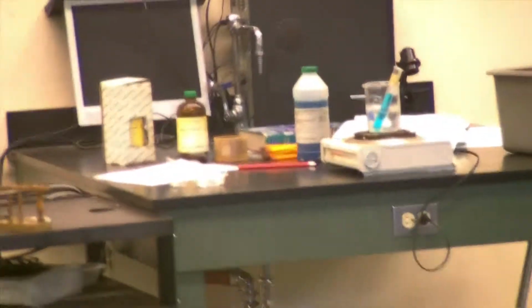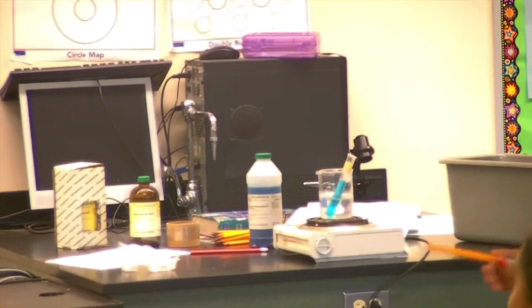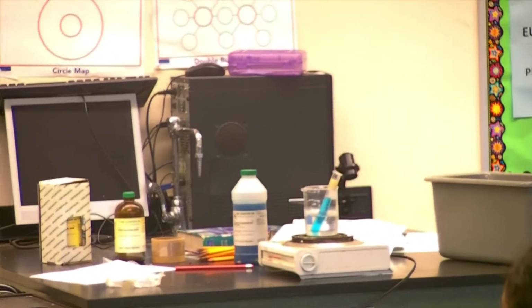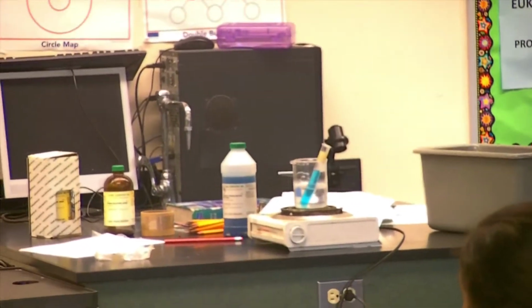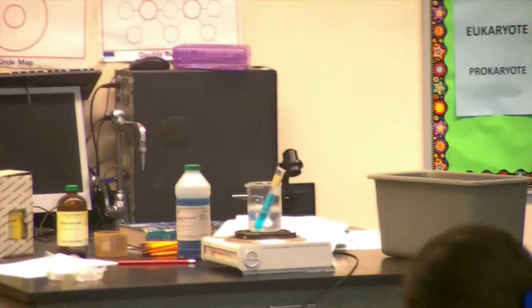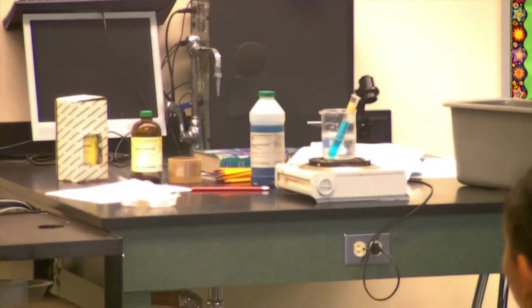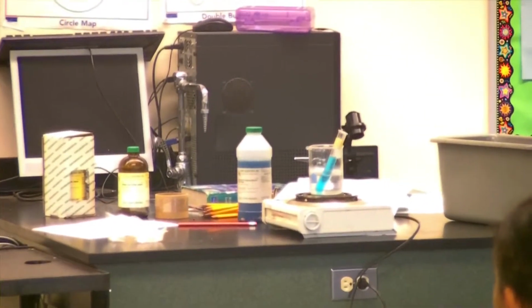We have found it out? Say again. Right. The beaker would have more water in it, right? Good job. So therefore, we could have weighed the bag before and after to determine if water left here or not. If water left here, or went inside here, what do we call that process?